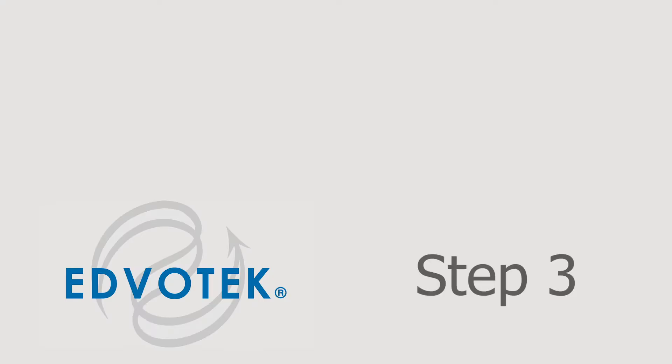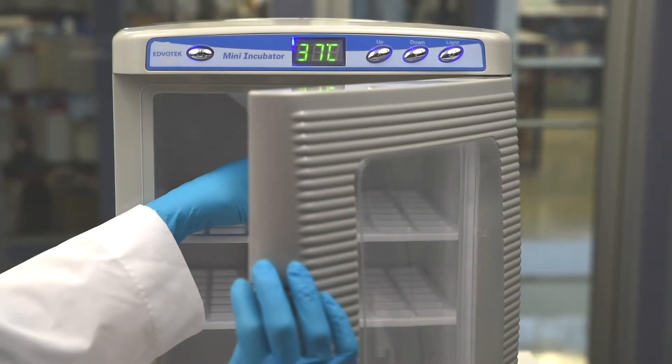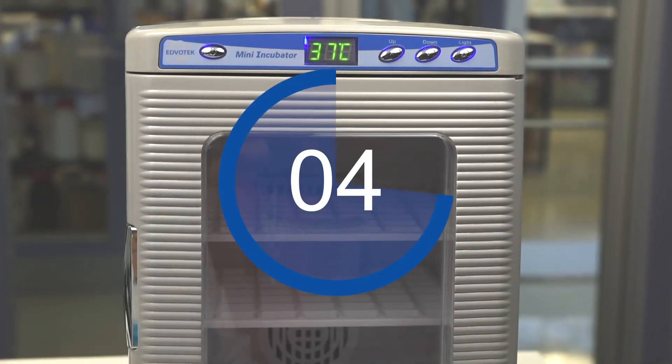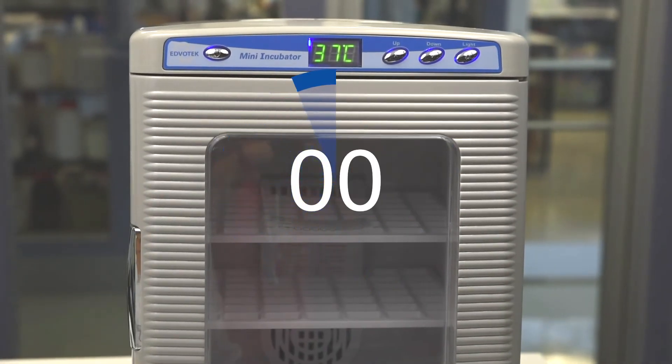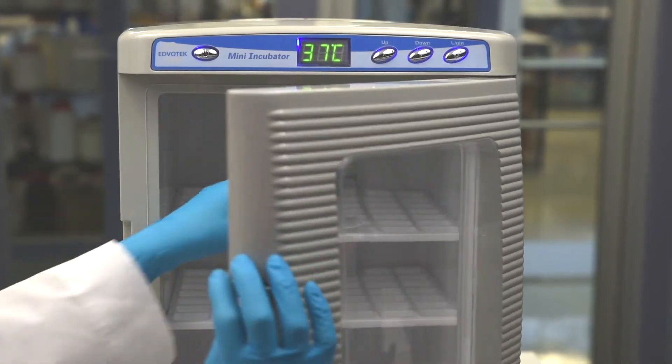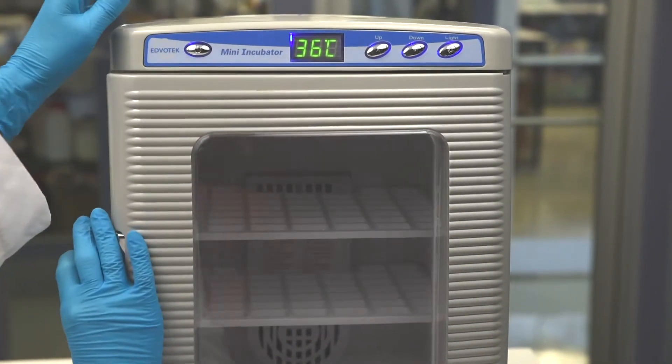Step 3. Incubate the microarray card in a 37 degrees Celsius incubator for 5 minutes or at room temperature for 10 minutes to allow the samples to completely dry.